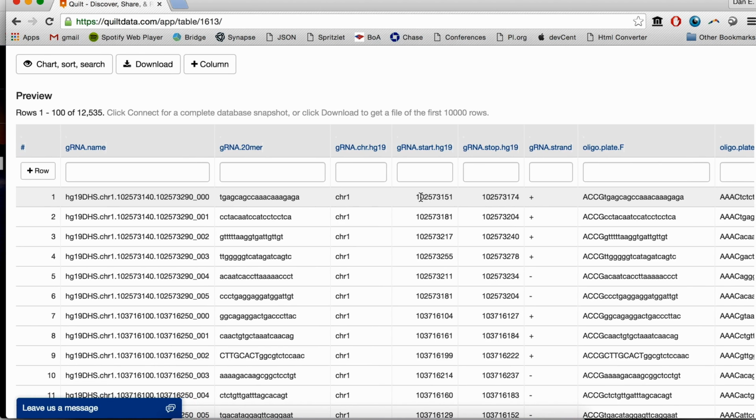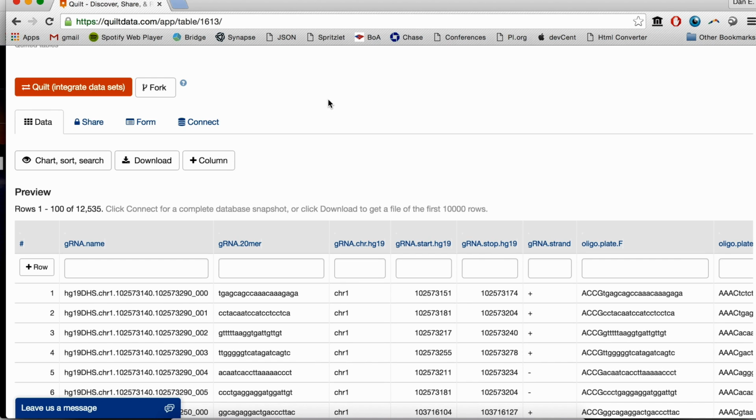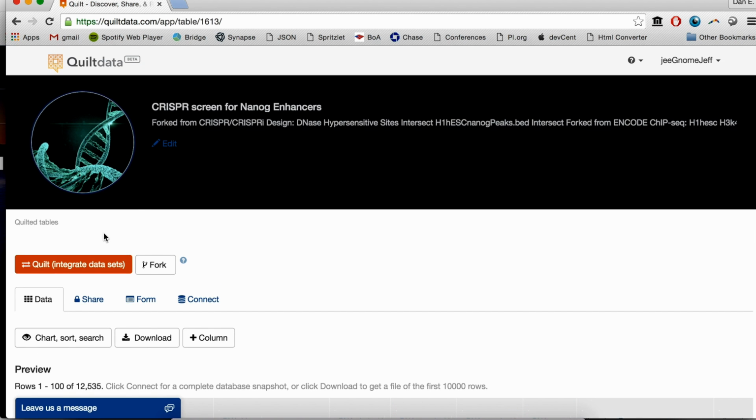So from there, you can go back to the first video in this video set about designing CRISPRs to see how those can be cloned, and you can start your experiment. So this has been a quick video to see how you would do that for enhancers, not just for genes.